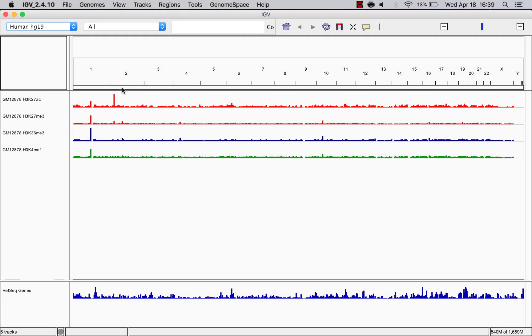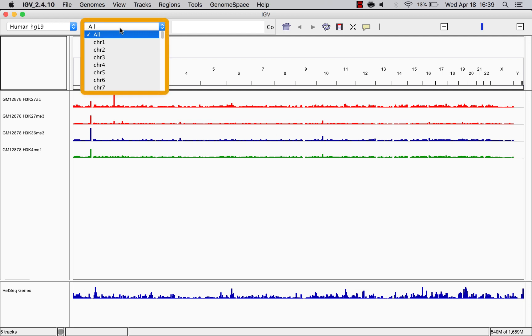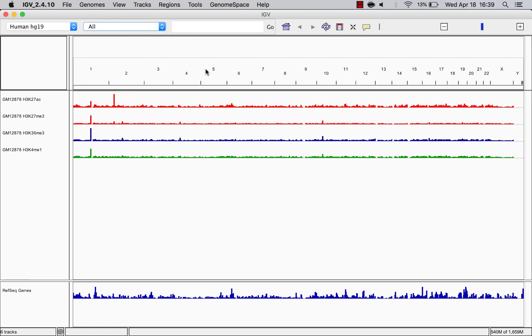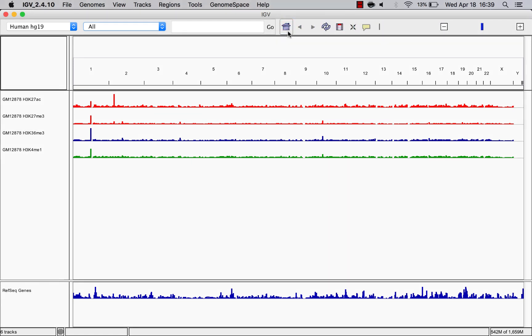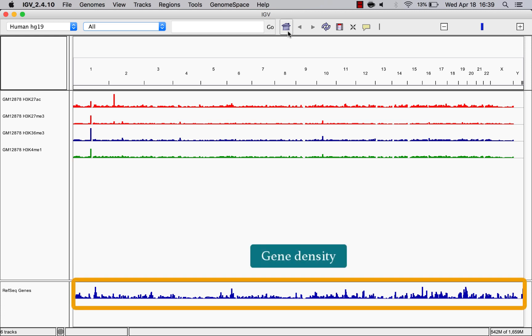To see your data on the whole genome level, select All from the chromosome dropdown or click the Home button. When we do this, notice that the RefSeq track shows a bar chart of gene density.